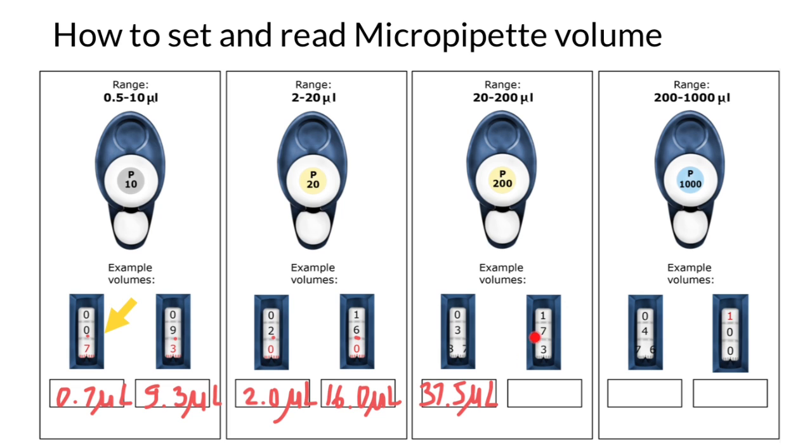And what do we have here on the right? As you see, we don't have any red numbers here, just like here. So we don't have any decimal point here. And we just read exactly what we see. 173 microliters. And as you see, both these readings are within this range.